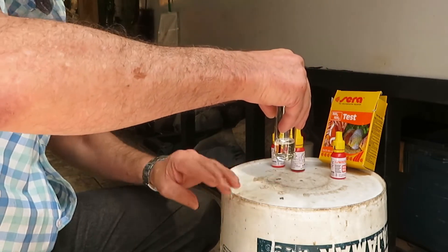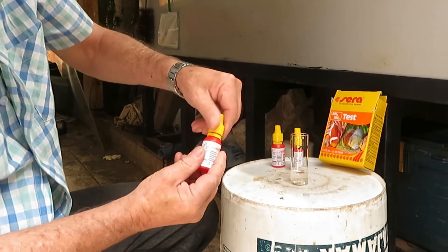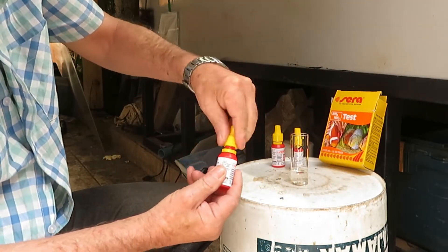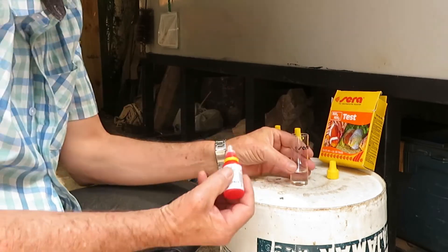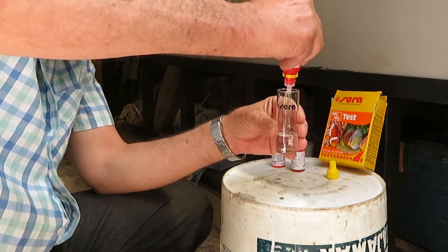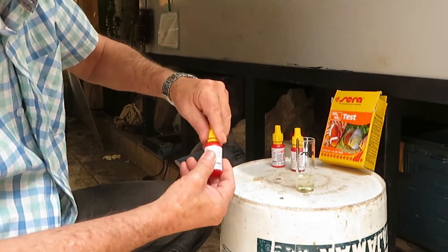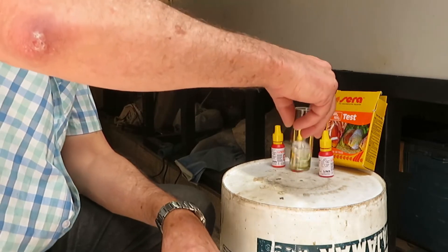Now we bring bottle 3, which also requires 6 drops added to the flask. We shake the mixture carefully.